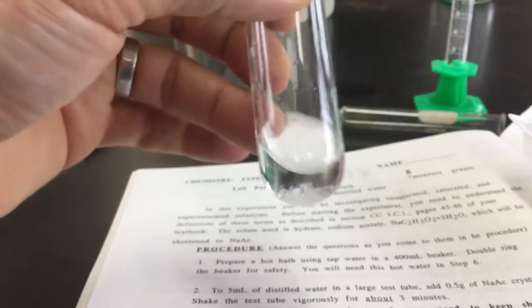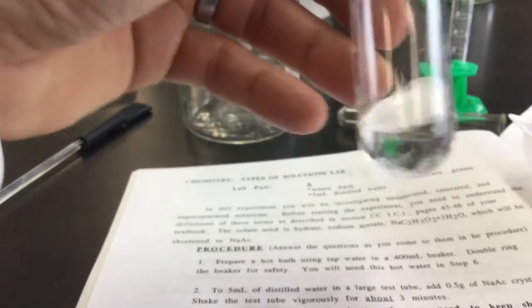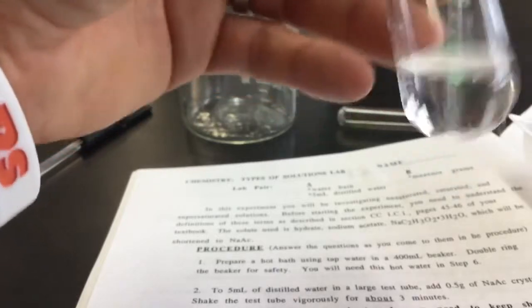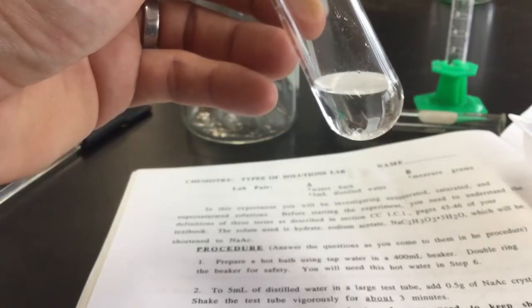If there's any on the sides, you can swirl it around a little bit. You're supposed to take a look — do you see any crystals in there? Is it saturated, unsaturated, or supersaturated? The first question asks: did all the sodium acetate dissolve? If I hold it close to the camera, you can see some crystals still at the bottom.